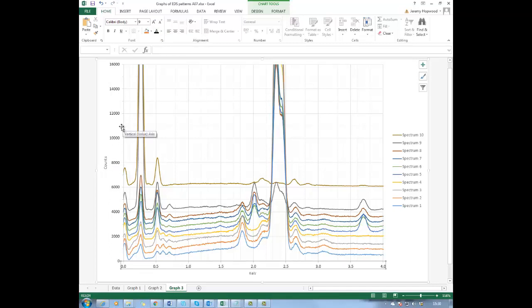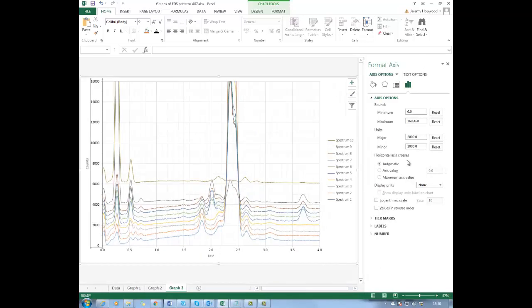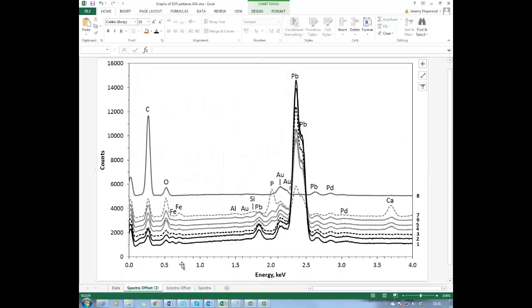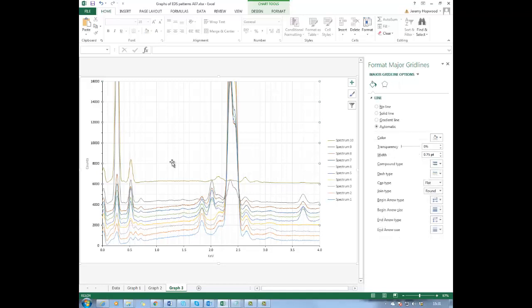So on here, the tick marks, if I format axis here, they need to go to black. On your computer it might not be like this, but on mine everything on the colours and fonts goes to grey. It's irritating. So click there, click this one here, the colour to black. What else do I need? Let's go back to that original graph. I'll get rid of those grid marks. So this one I can just touch the grid marks, delete.